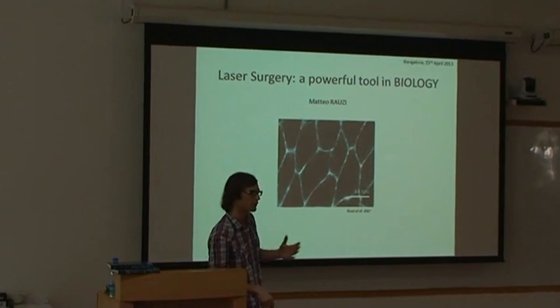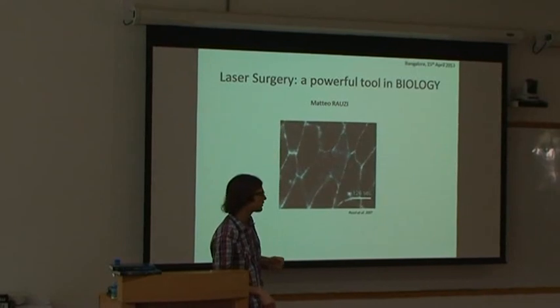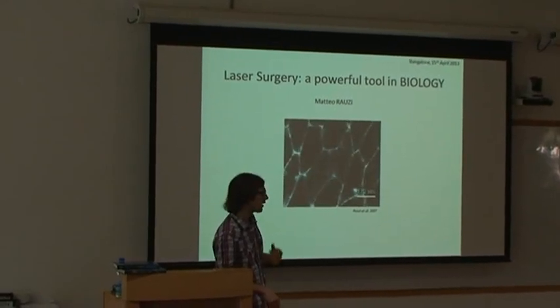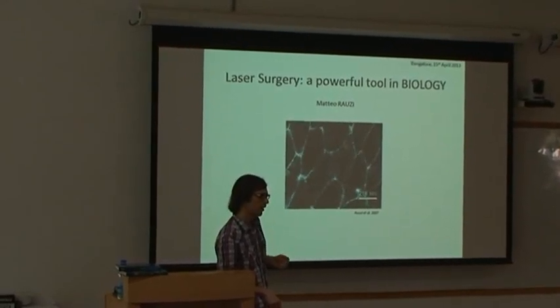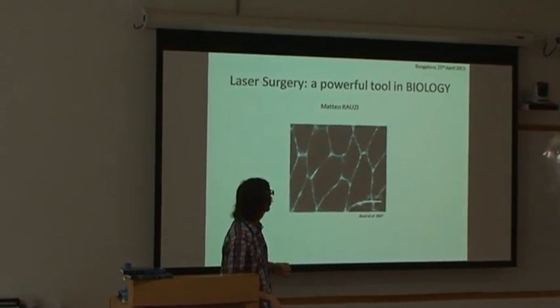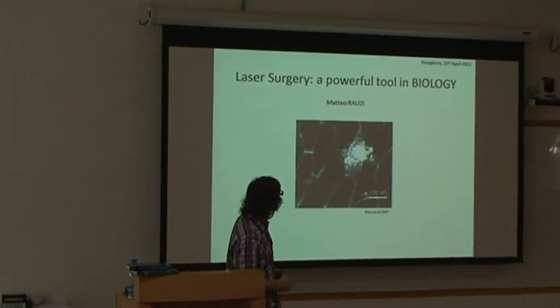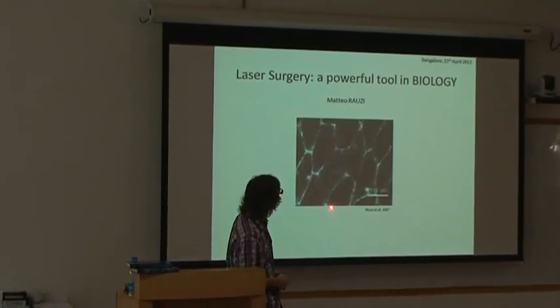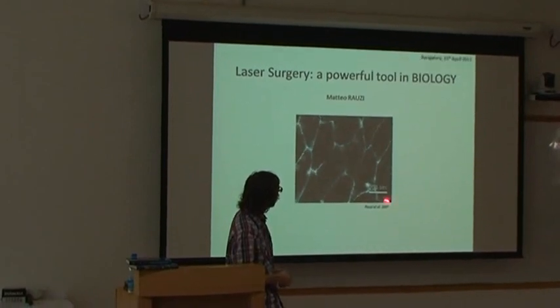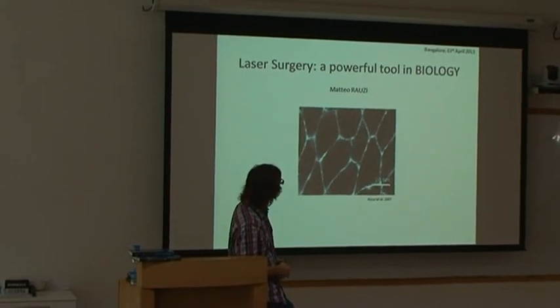I will show you that with different lasers, in fact, you can do different things, different types of laser dissection. And then finally, I will show you different examples of how you can implement this technique on different in vivo specimens. So this first video that I'm showing you is something that I published myself in 2007. It's a work that I will present to you in the end.